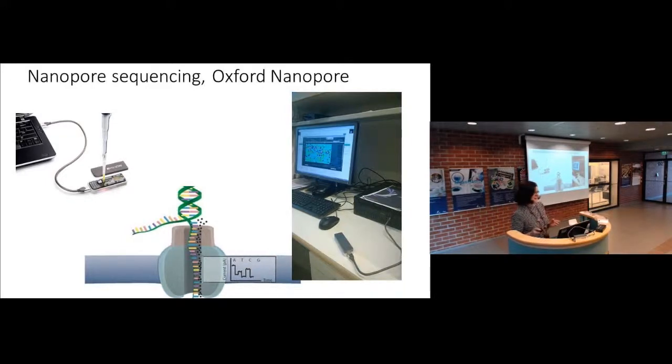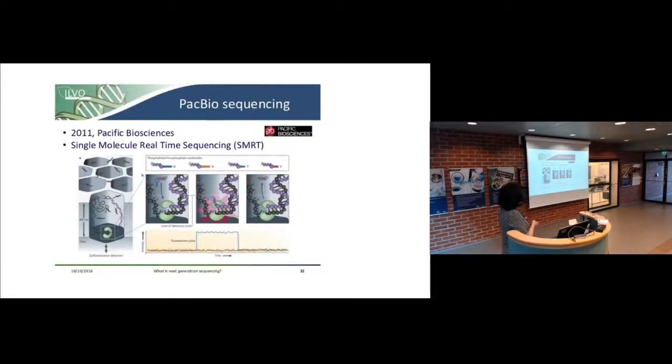We felt at first that it's just a toy and it's fun to play around with, but I'm actually taking it more seriously now, because it's getting better all the time. It still makes lots of errors, but so does PacBio. And PacBio is a €500,000 machine, the size of half an office room or something.